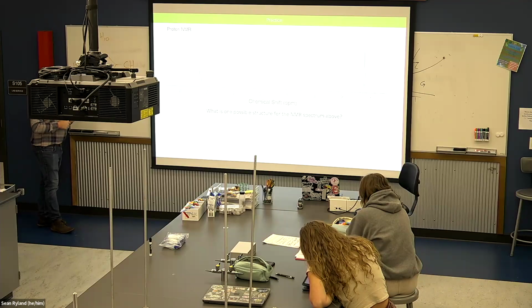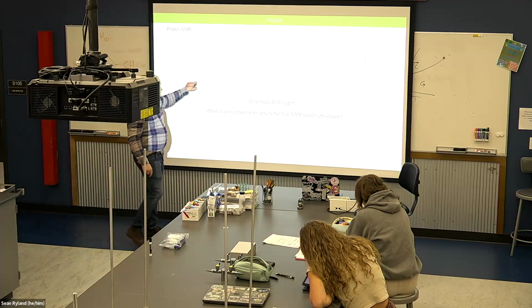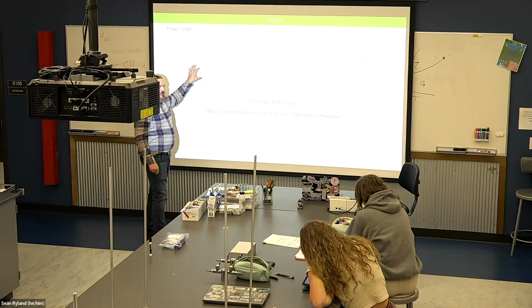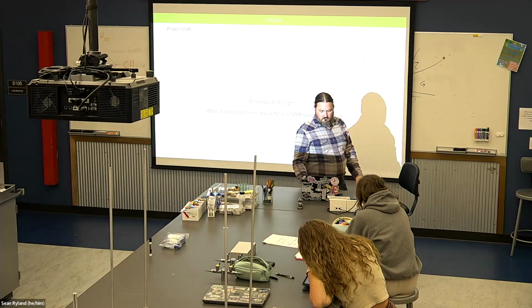So it's not always going to be messy, but you don't need to worry too much about the peak splitting on the aromatics because it's more about where it shows up and what the integral is. It's going to be where you get most of your most reliable information.